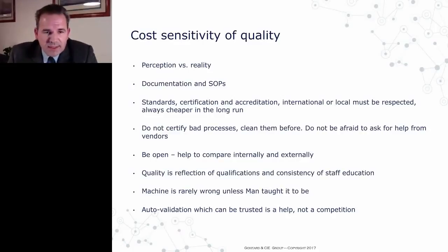When it comes to quality, because quality is one of the three components that the TCO quantifies, so the money, the time, and the quality. TCO is like a 3D model for each assay, where you get a 3D coordinate for each of your unique assays, and you see your assay move in time. As you improve your processes, you see your assay get closer to the point in space where it should be to produce really quality, in time, efficient results.